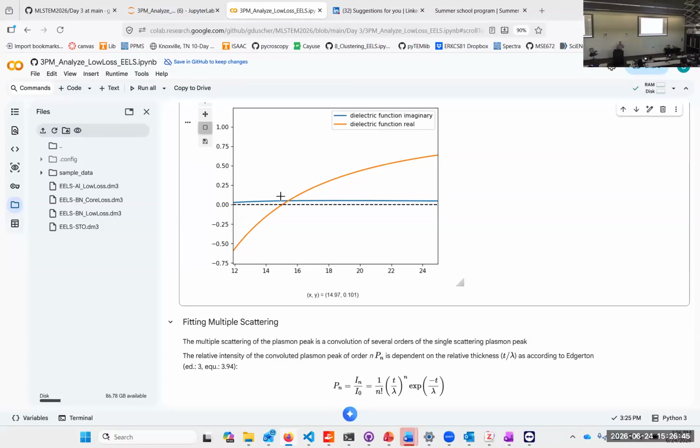So anyway, what we need is a sample. The sample is full of electrons. So we assume here is our sample. Our electron is far away. Nothing, the sample doesn't see it. So now we make a Gedanken experiment, and since this electron is fast, put it in the center of our sample. The electron that comes is negatively charged.